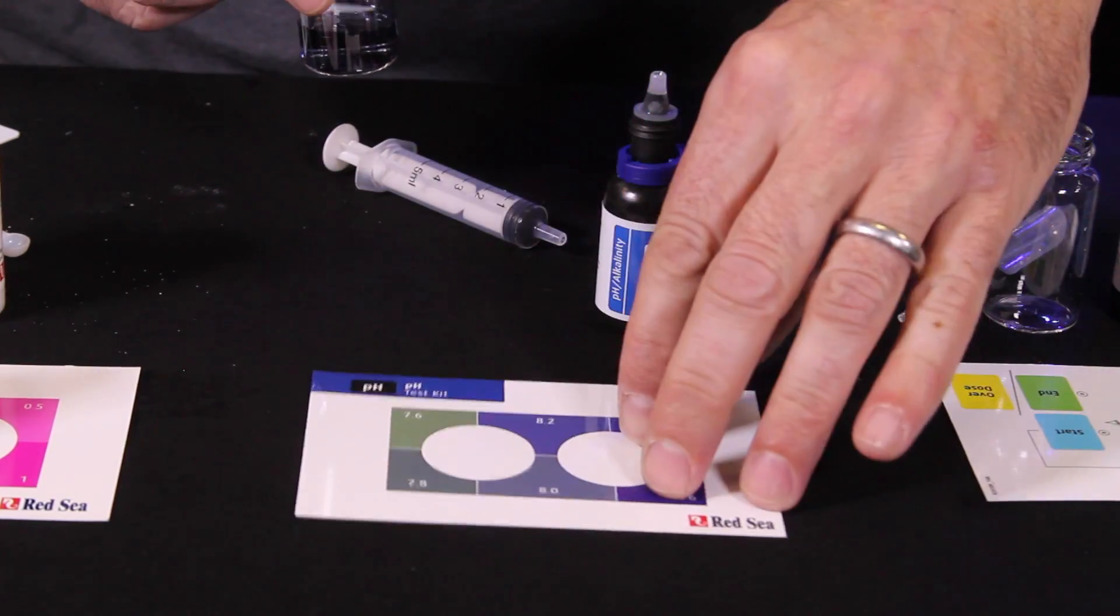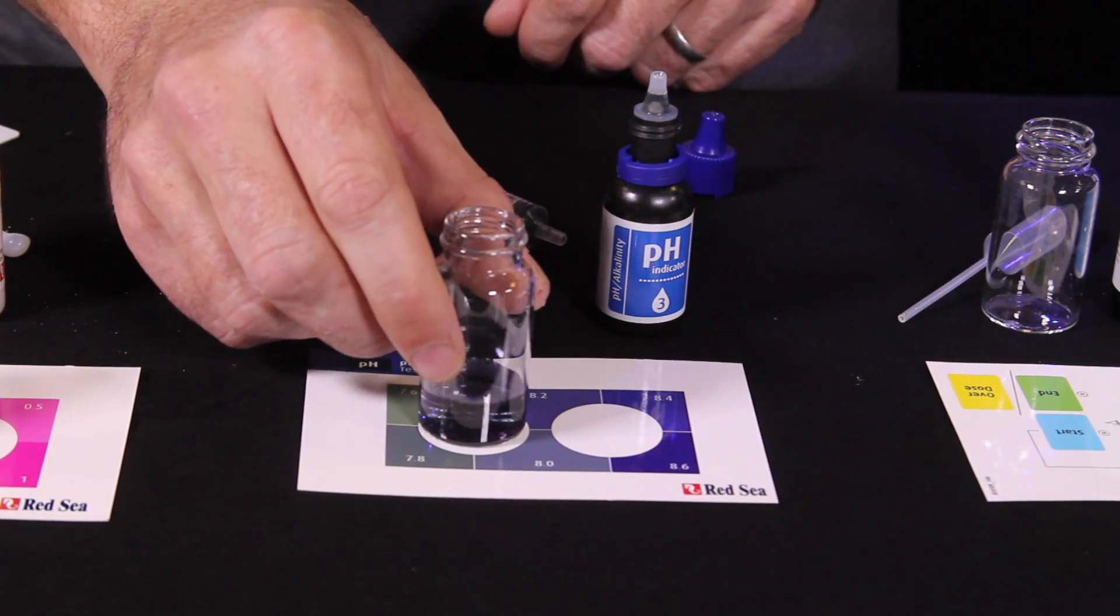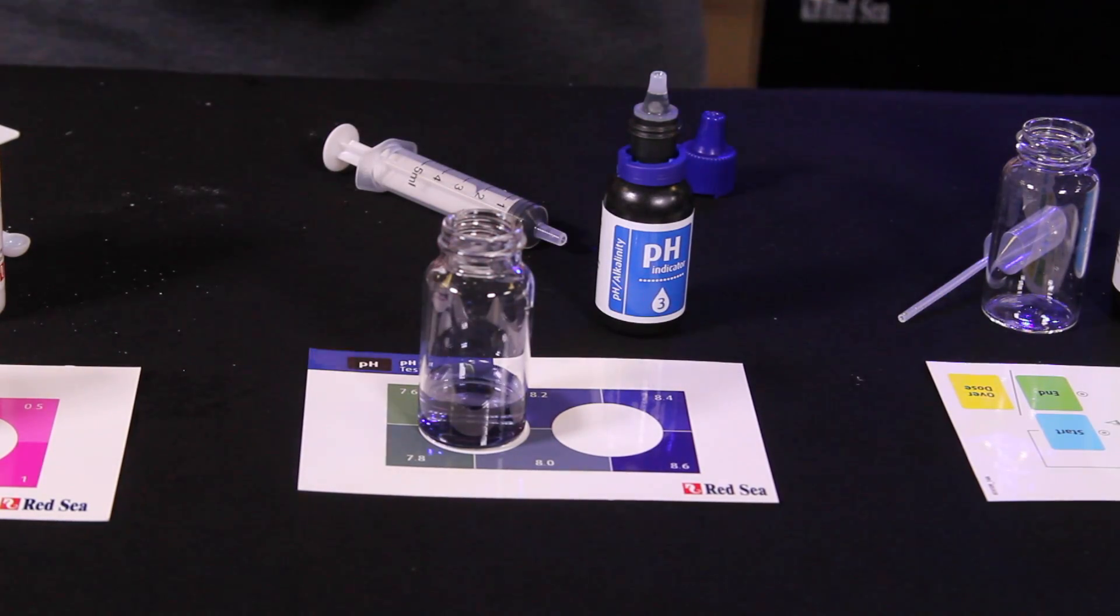And then we're going to flip our card over. We'll set our test vial on our color comparison chart and come back shortly to check our results.